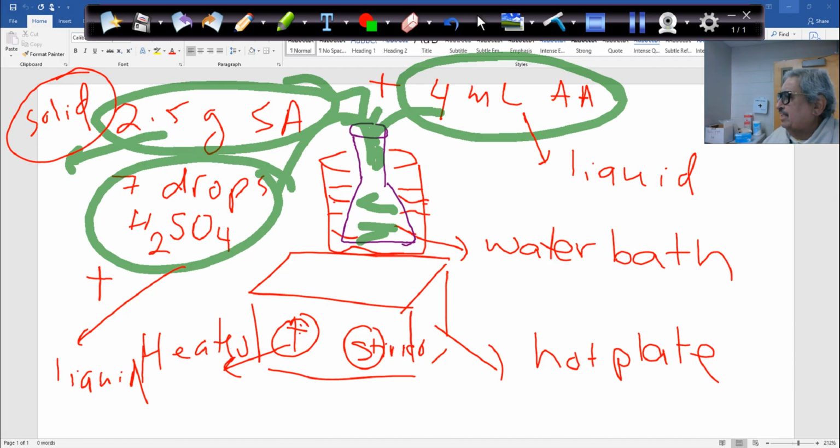We're adding this icy H2O to help the crystals to grow quickly and precipitate quickly. That's the whole idea. Otherwise, it will take a longer time for aspirin, acetylsalicylic acid, to be produced. Correct, guys?